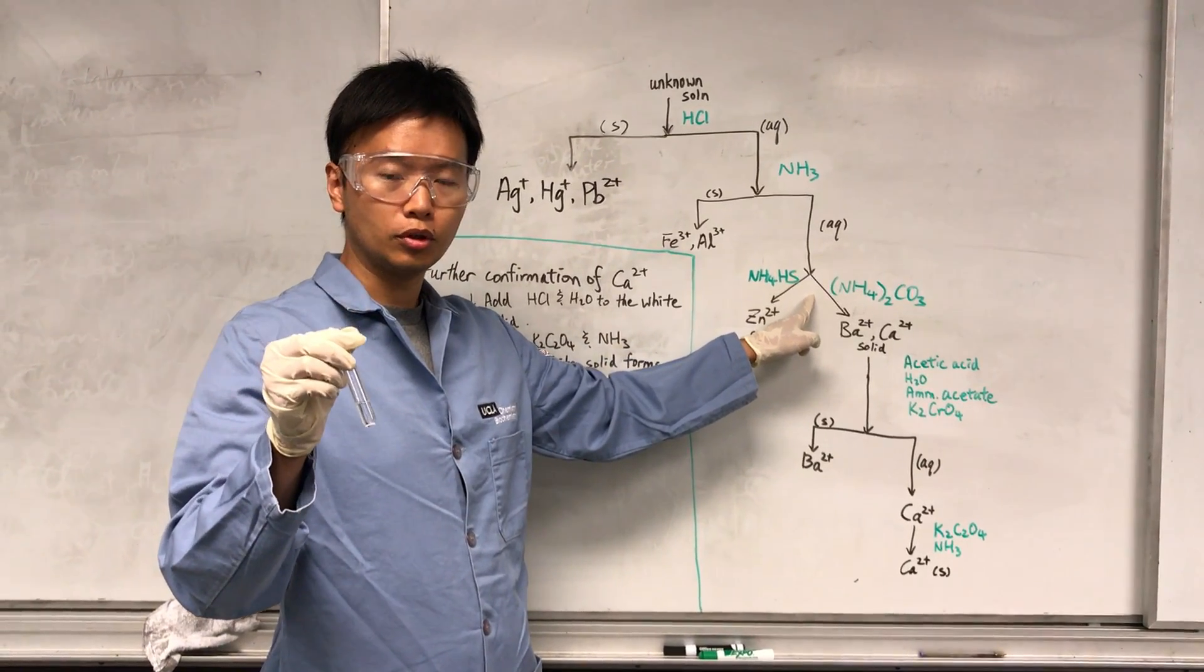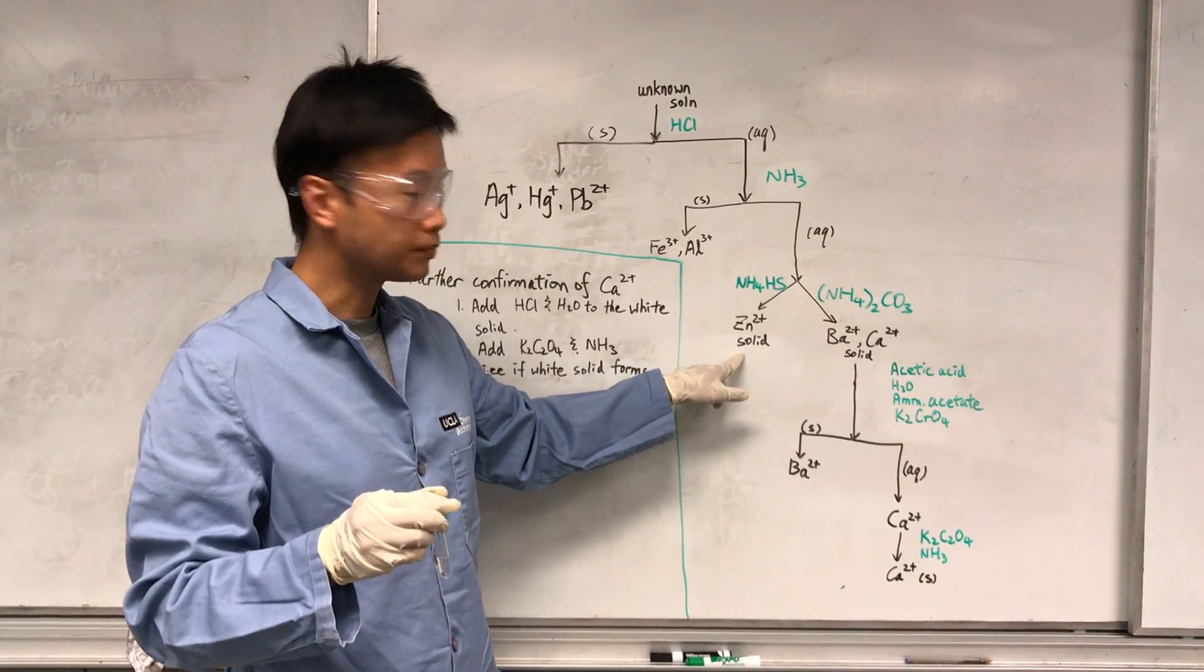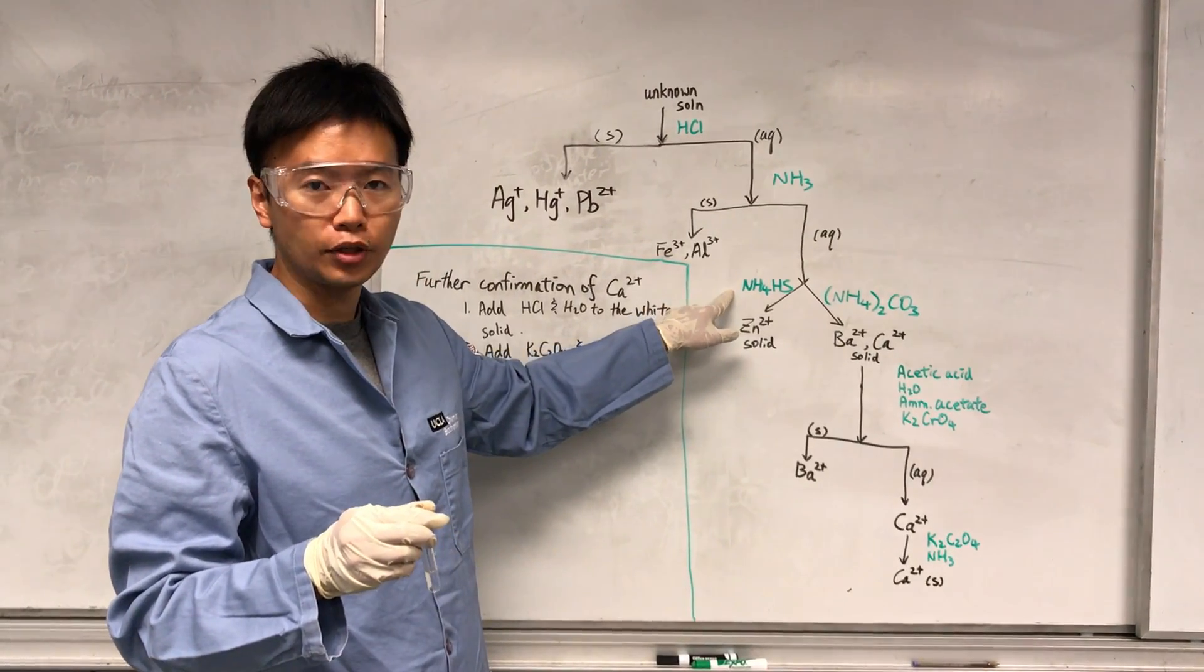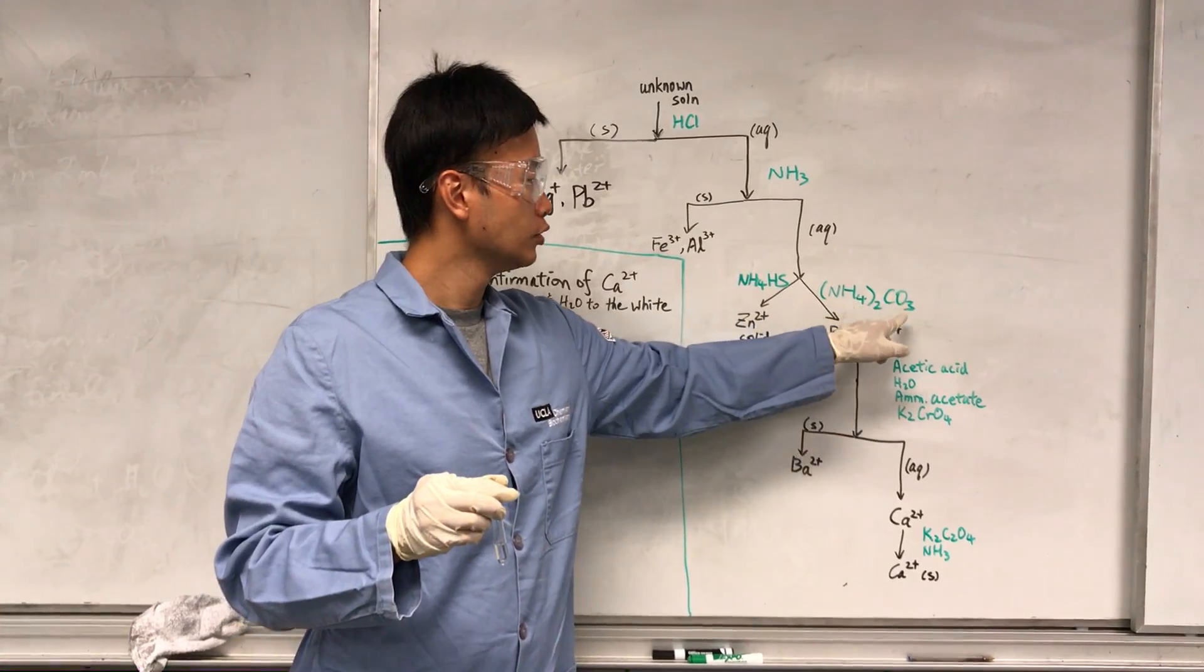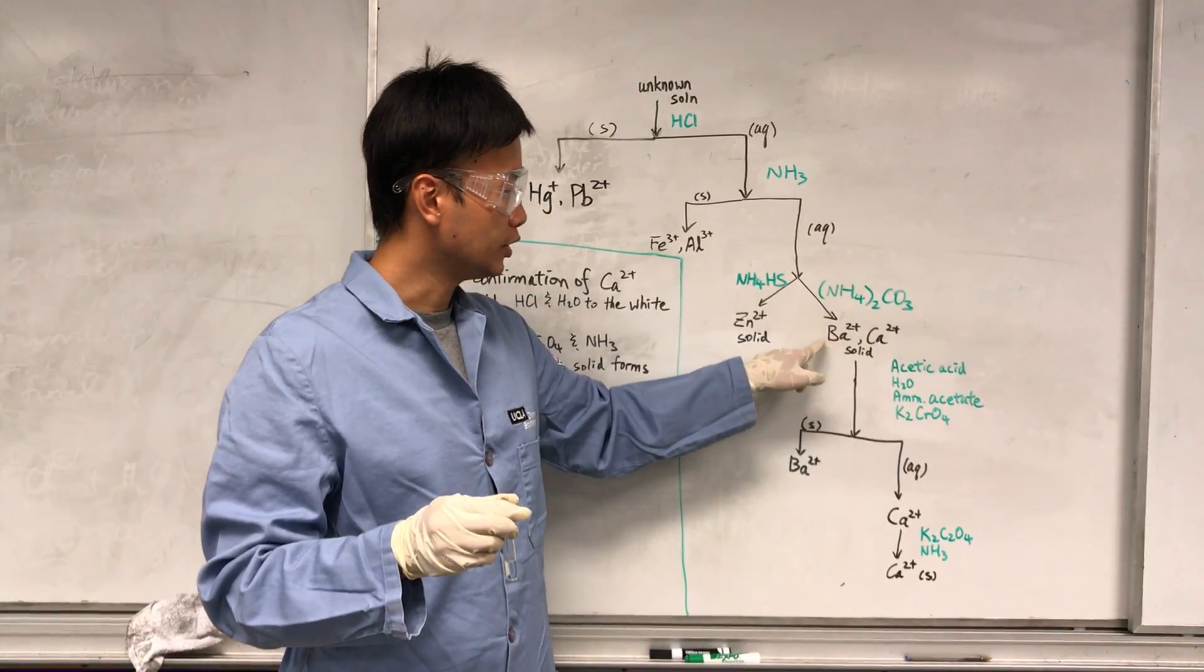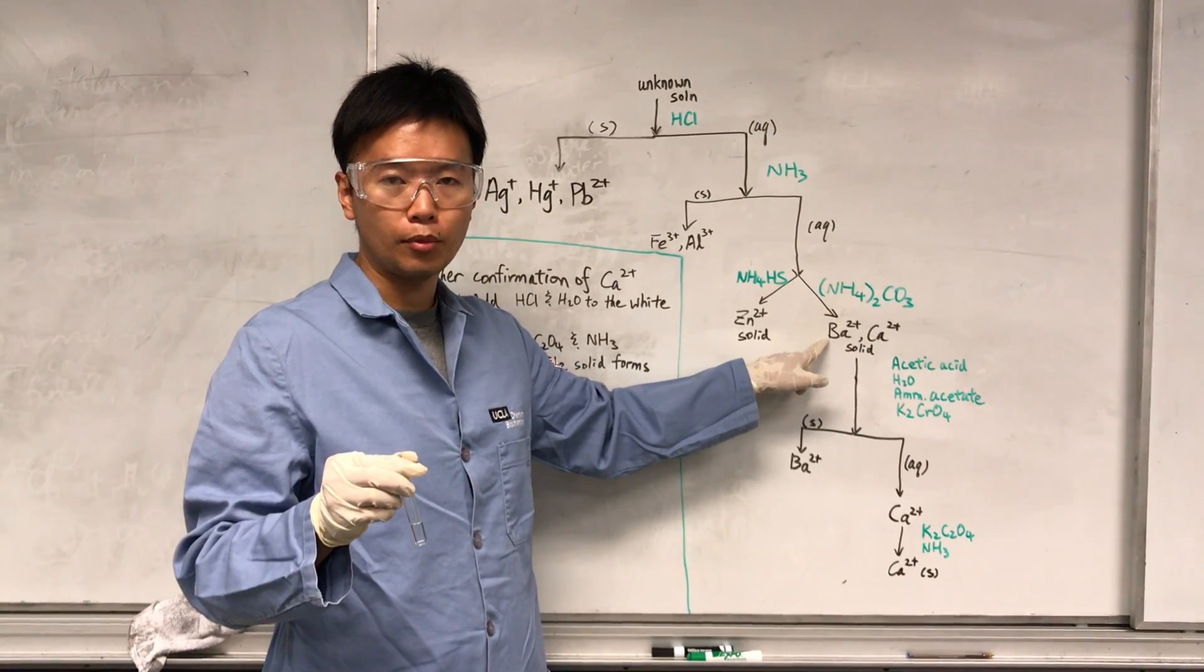In that case, I will split the solution into two portions. One portion I'm going to test for zinc by adding NH4HS, and the other portion I'm going to add (NH4)2CO3 to see if there's any solid form. If there's any solid form, then it indicates I may have barium or calcium.